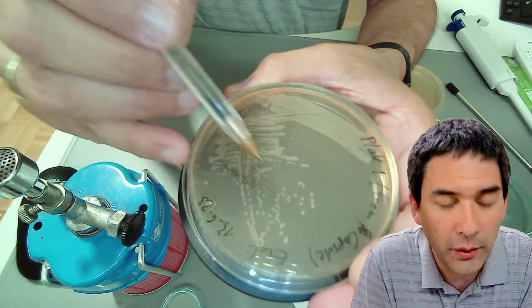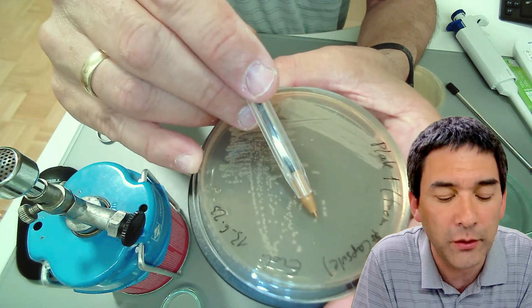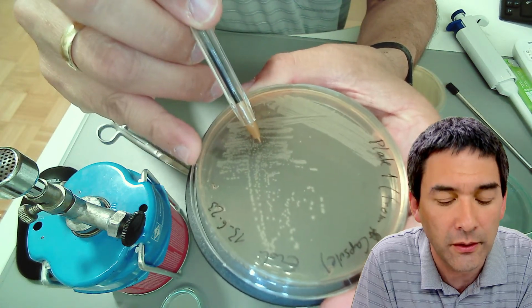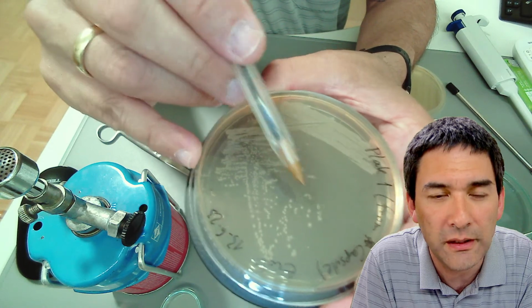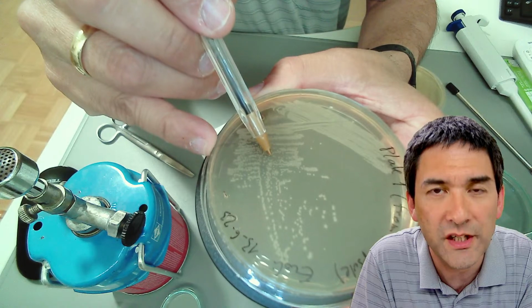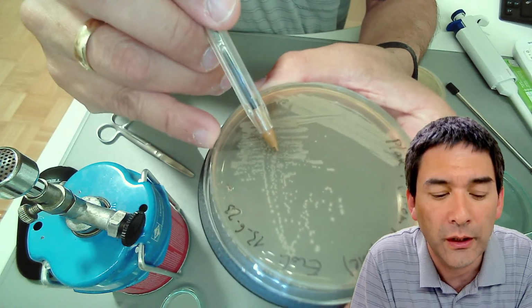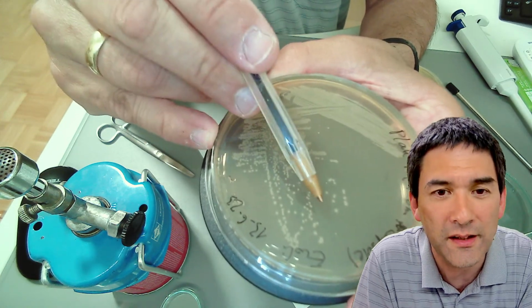One thing that you are going to notice, however, is that the size is not always the same. So why is it that, for example, the colonies over here are so much larger than the ones over here? If this is the same bacterium, shouldn't there be the same size colony? The reason they are much smaller here is because they're competing for the nutrients. They're running out of food, and they're building up wastes, and therefore they cannot grow as quickly as the one over here.